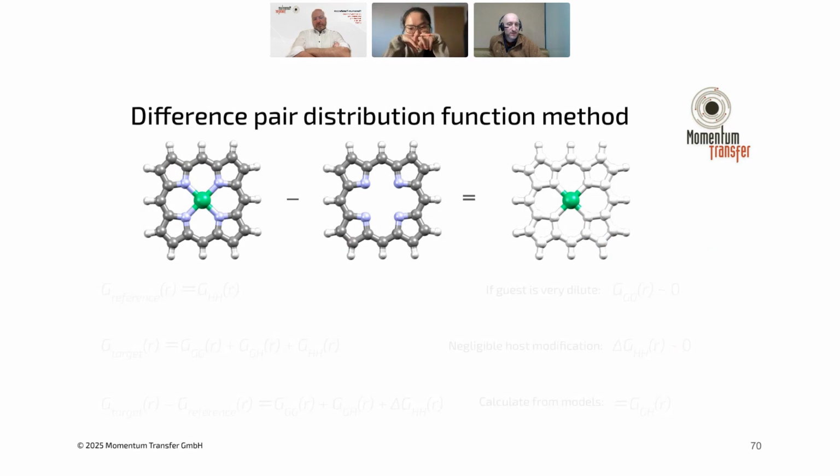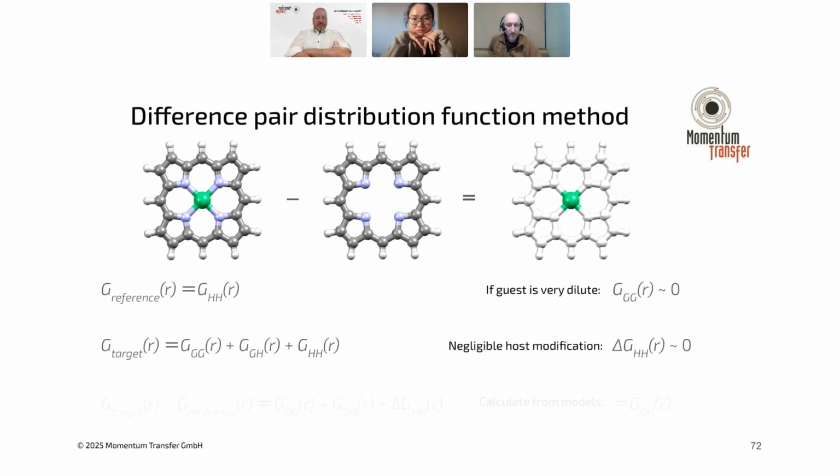And the idea here is that we have a small amount of our target catalyst material present in the support. And we want to specifically understand the coordination environment of those active sites. So we need to remove all of the extraneous information from the support itself, because we don't really care so much about the support and it's masking the part that we're interested in. And so conceptually, an easy way to do this is if you measure a reference pattern for the support without any of the catalyst sites loaded, and then you measure a target material which has the catalytic sites loaded into the support.